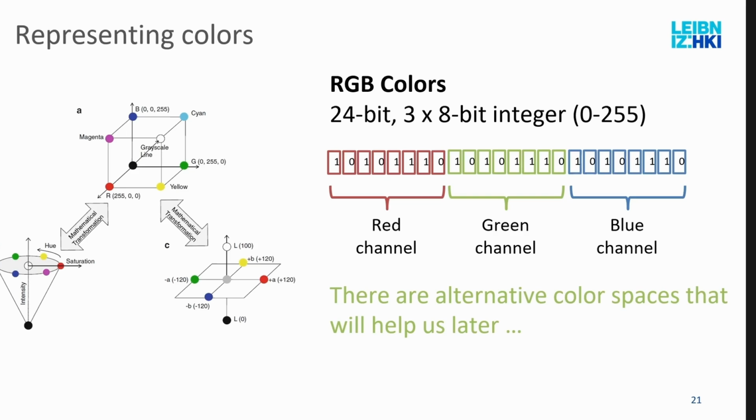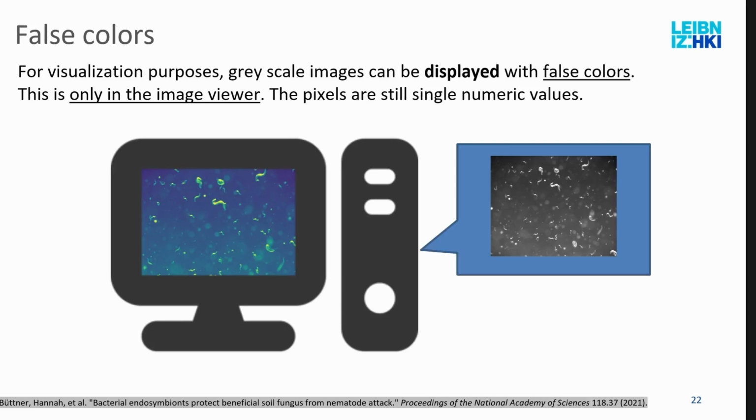This comes a bit later, okay. This is a super confusing concept, because this is also called channel and is something different from that. I will explain when we go to file formats how they actually store it. This is mostly not a concern. So when you have a 12-bit image that has 3 channels, the channels are stored in a different way so that it does not affect the range that you have. But this will come later.